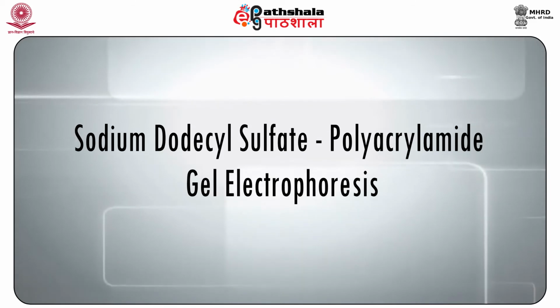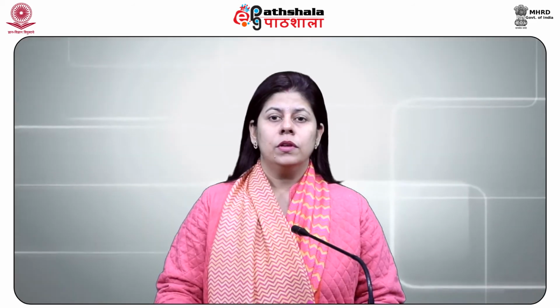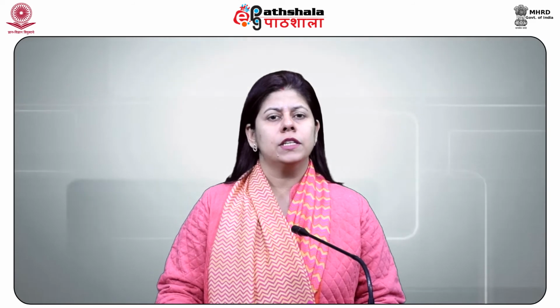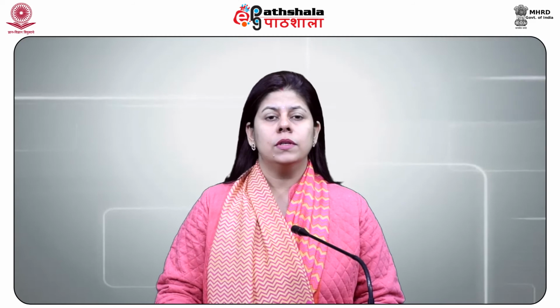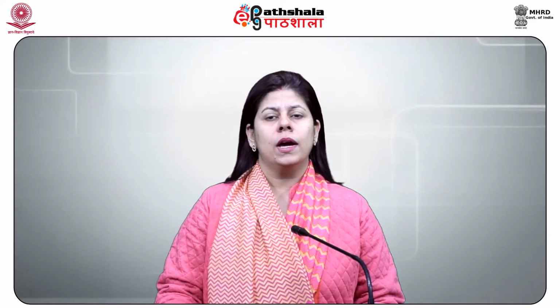Sodium dodecyl sulfate polyacrylamide gel electrophoresis. One of the conventional means of examining proteins by electrophoresis is by using sodium dodecyl sulfate polyacrylamide gel electrophoresis. SDS is a detergent which coats a linear protein sequence with a layer of SDS molecules and denatures it by binding to the hydrophobic region of the protein. Due to its negative charge, it becomes the dominant charge of the complex. The binding of the number of SDS molecules is directly proportional to the size of the protein. Therefore, there should not be any change in the charge to mass ratio with size. In solution, principally all different size proteins covered with SDS would run at about the same mobility. However, the proteins do not run through water. Instead, they run through an inert polymer known as polyacrylamide.